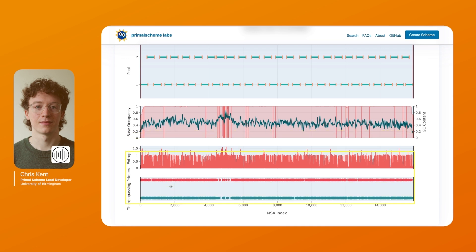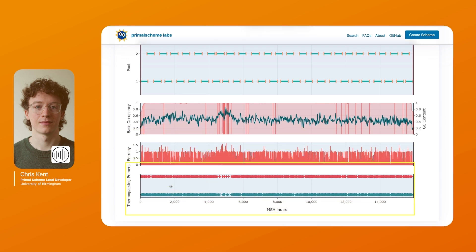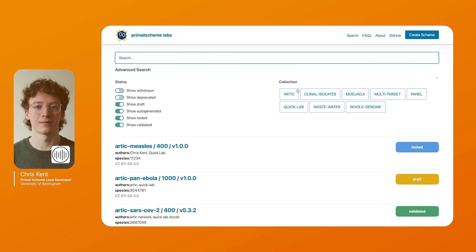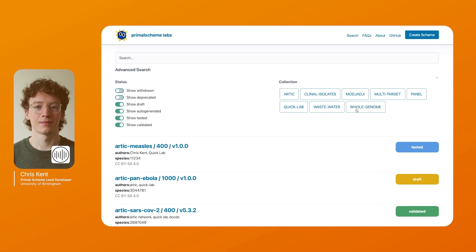We also have the entropy of the MSA to show you where hypervariable positions are and how the primer scheme handles them. We also have a list of all the primers which have passed the ThermoChecker so you can see how well the scheme has worked and how well it's performing. We also have a collection of tags for schemes with common search criteria. This includes Arctic schemes, schemes made by the Quick lab. We also have collections for common use cases such as for clinical isolates or for wastewater.